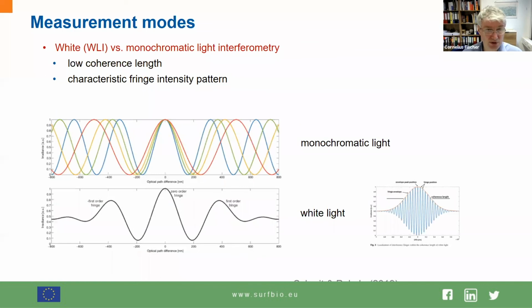Remember what the machine will do when the sample surface is scanned. It has to detect the intensity as shown here in this interference pattern. So with a high-speed camera, you have to detect all the amplitudes, and then you have to compare whether or not this intensity is really bigger than this.